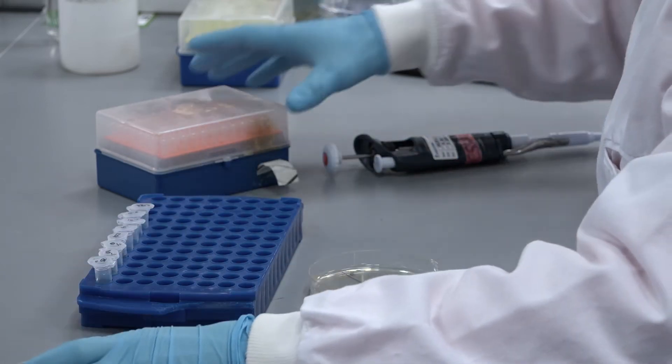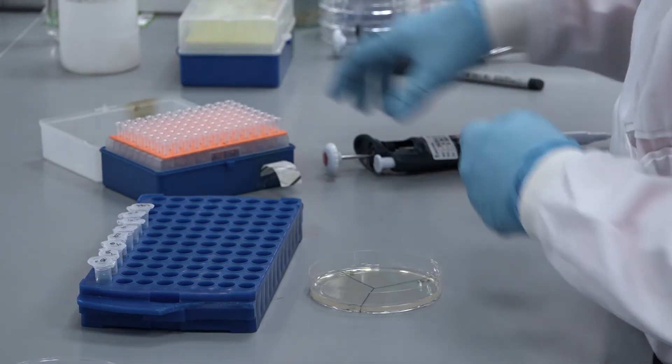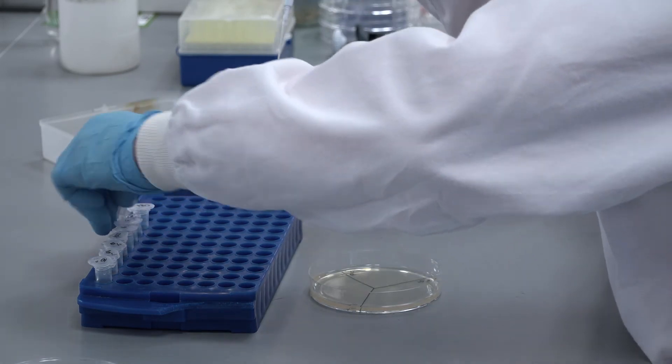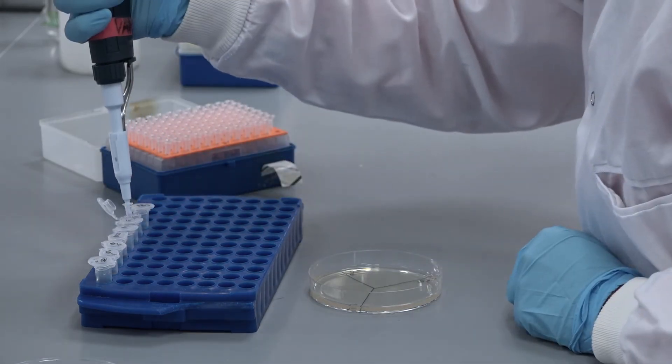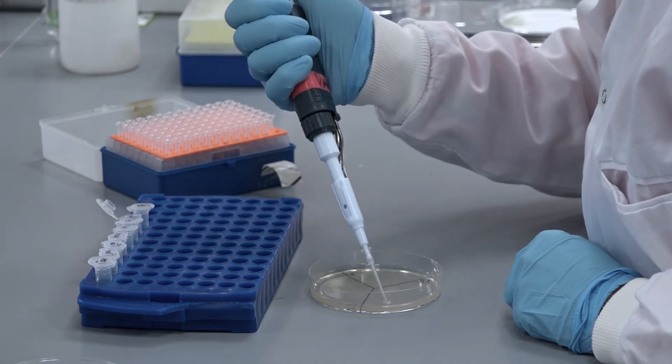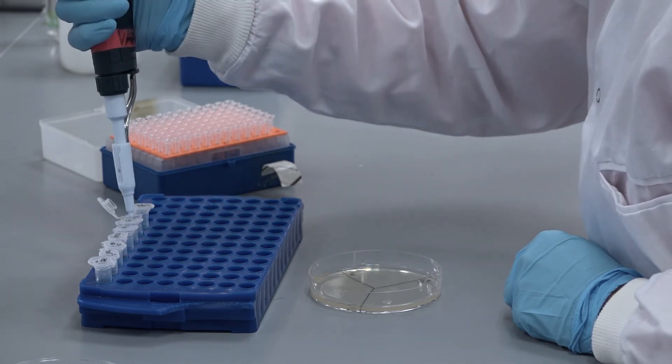To measure the actual doses injected into the larvae, plate out a dilution series of each dose on LB agar plates down to the minus 6 dilution and measure the CFU per mil.